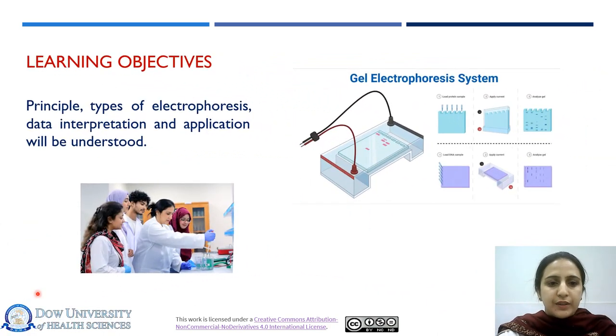So by the end of this lecture, you will be able to understand the principle of electrophoresis, the types of the various electrophoresis, and what information you can get by using those types of electrophoresis about your sample. And you will also be able to have a little bit of information about the data interpretation and various other applications of this technique.